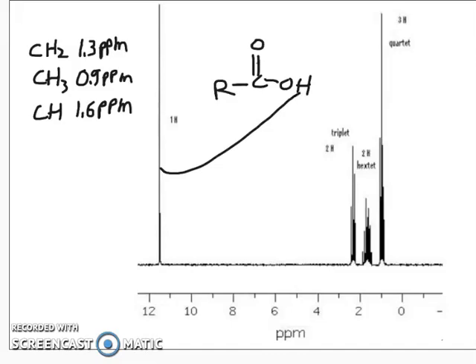There are more detailed chemical shift charts that you can and will consult during the course of the semester. We don't have time to go through the details of those charts today, but I did want to highlight some important chemical shifts that you should know.